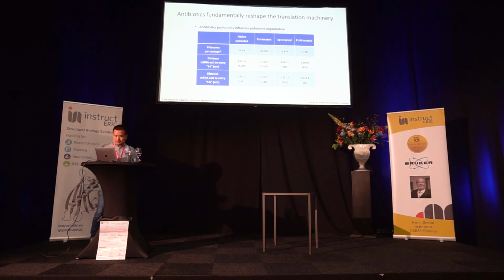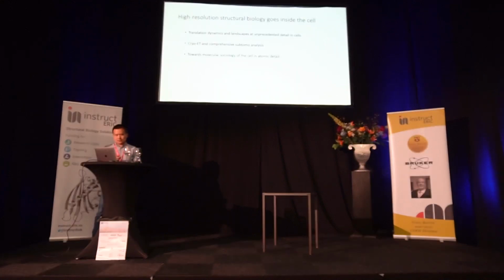So, I think I next come to my last slide to take a quick summary. Using cryo-ET and comprehensive subtomogram analysis that includes averaging, refinement, and spatial organization analysis, we are able to determine the structural dynamics and also landscapes of translation at unprecedented detail inside genome-reduced bacterial cells.